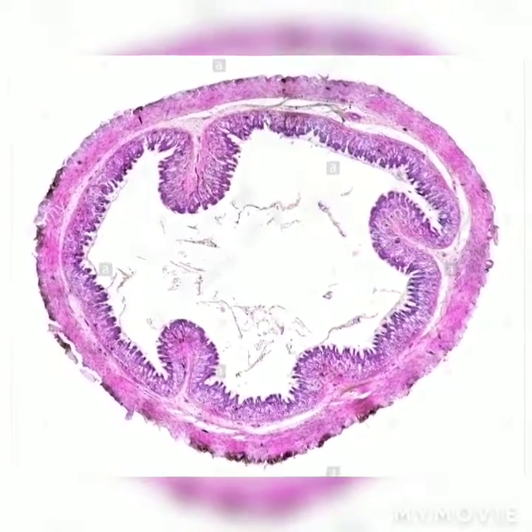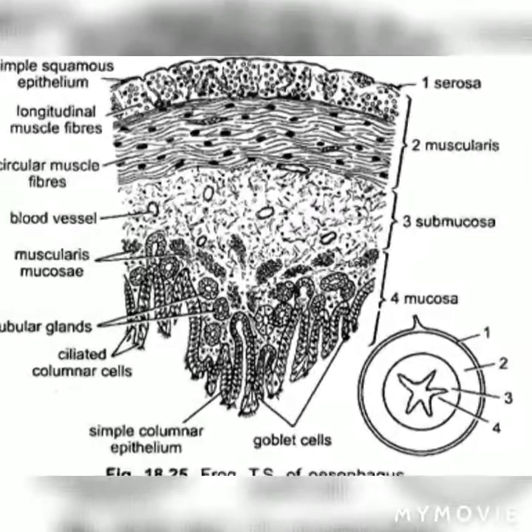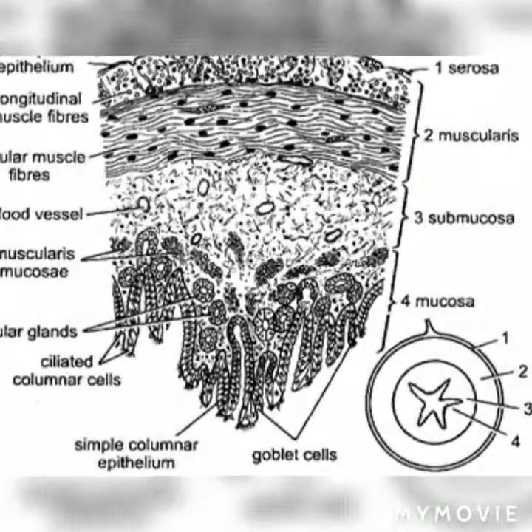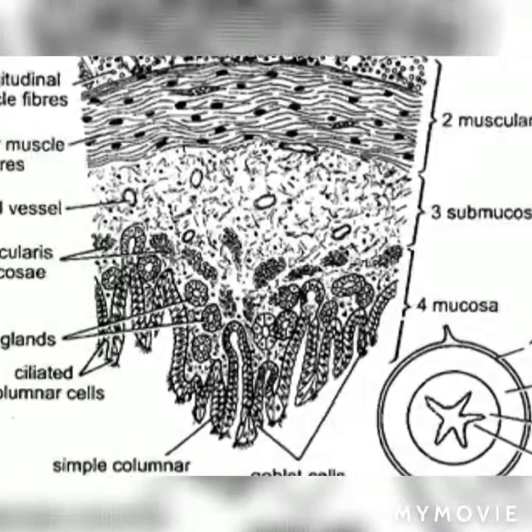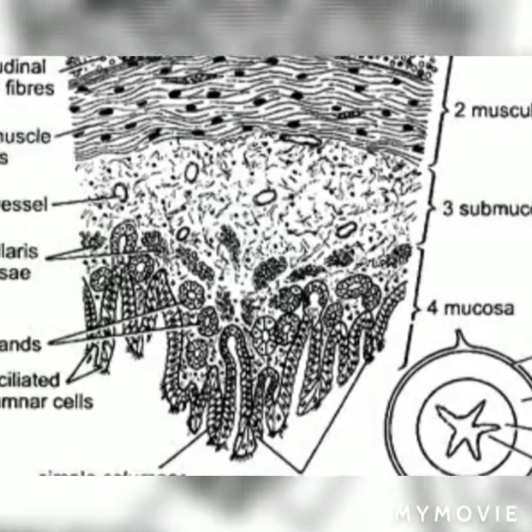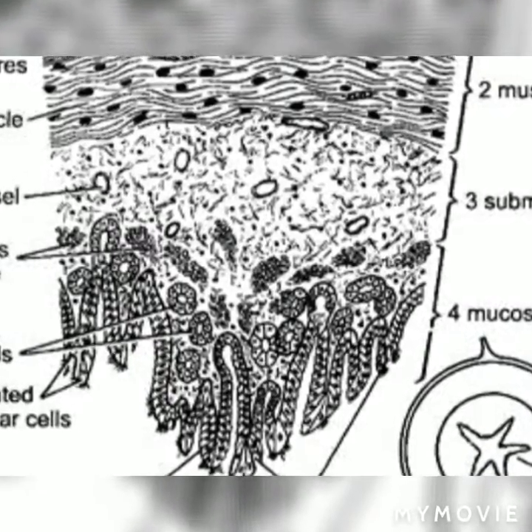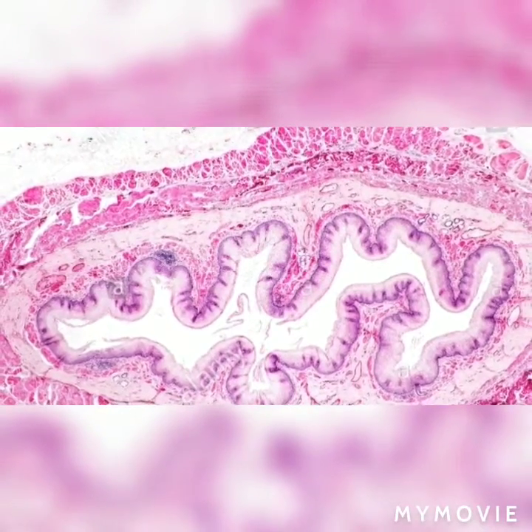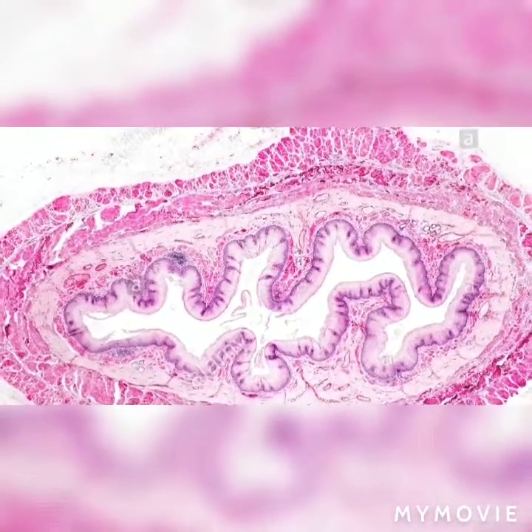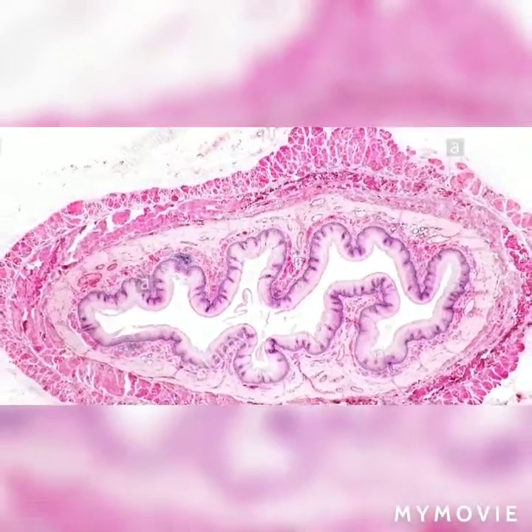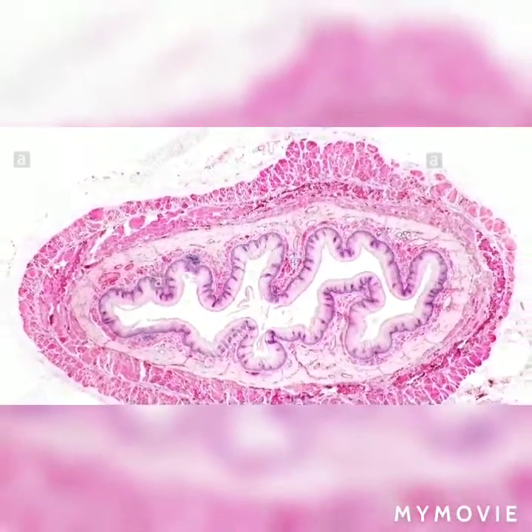The sub-serosa consists of a thin layer of connective tissue. The sub-mucosa lies below the circular muscle fibers and is made up of loose connective tissue. The mucosa is the innermost layer and consists of simple columnar epithelium. The tubular gastric glands open into the lumen of the stomach through a narrow duct and secrete pepsin and hydrochloric acid.